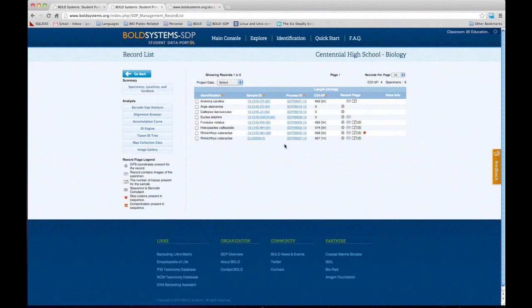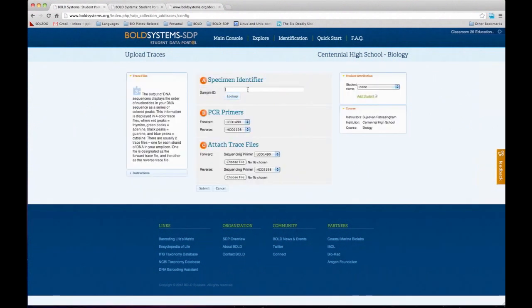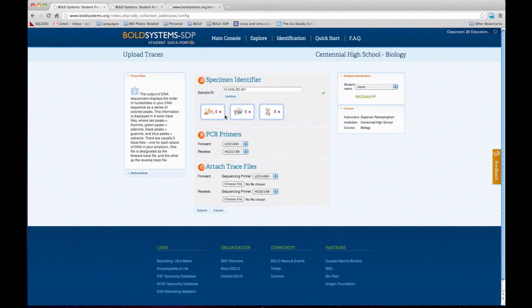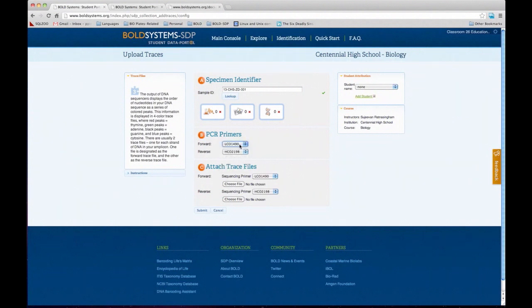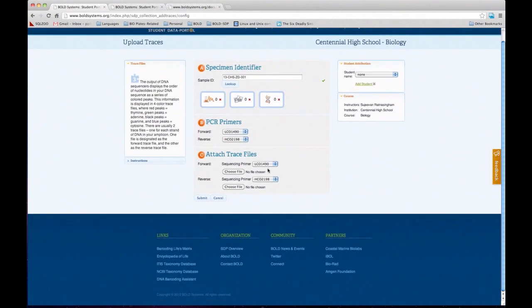I want to upload traces to a different sample — I'm collaborating with a different student on a different sample. I copy that sample ID and paste it in. Again it tells me there are no photos, sequences, or traces for that particular specimen. Then I choose which PCR primer I used — we provided a drop-down menu with the main PCR primers. If there are any other primers you are using in your class that are not in this list, please contact us and we can work on adding those. I have forward primers, and then the sequencing primers as well — you have to enter that information.